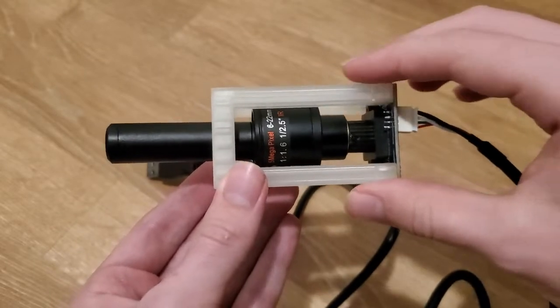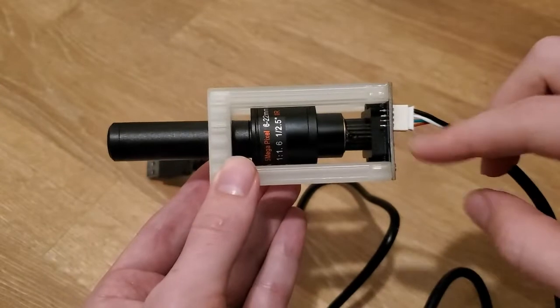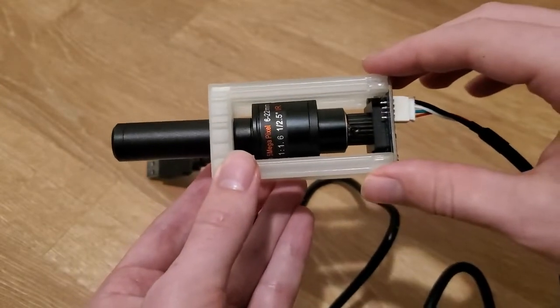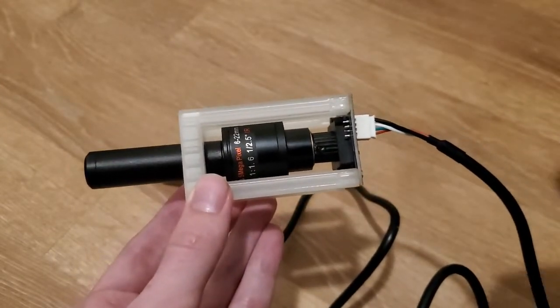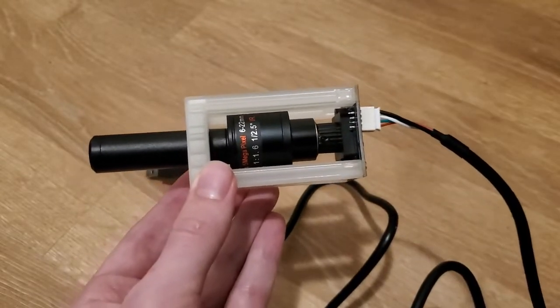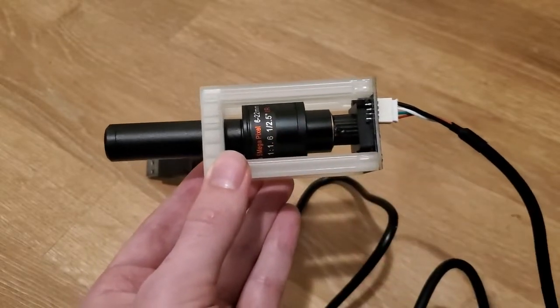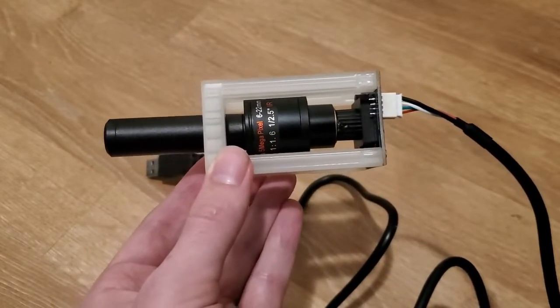I chose to 3D print the structural part to improve the accuracy of alignment between the components, and because it made iterating on the design simpler. Initially I also tried using the 12mm lens suggested in one of Les' videos, but at least for my setup the focus seemed to be off. As a result, I switched to the 6-22mm variable lens you see here, which provides a bit more adjustability to the system.